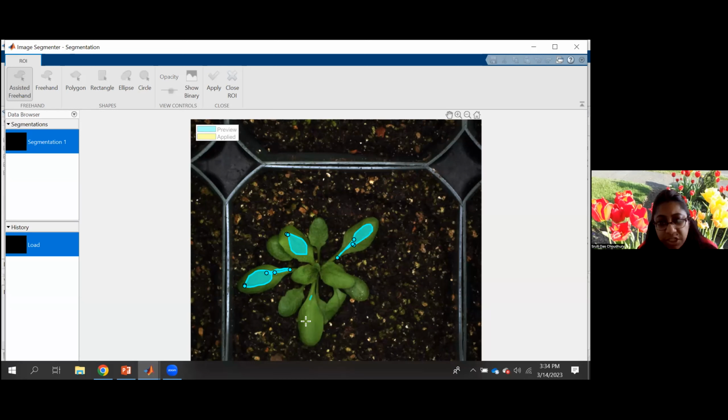Here we must notice that the initial drawing of ROIs definitely plays a very important role in the accuracy of segmentation. But for a quick reference, I will not spend much time on it. Just to show you how active contour works, that is my goal here.